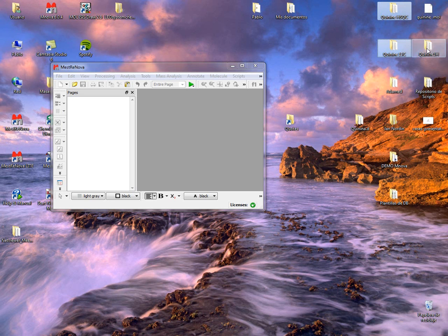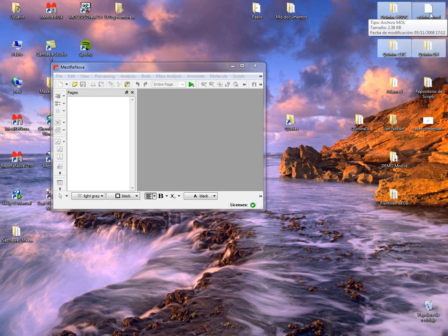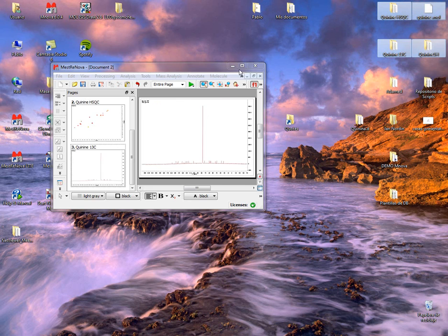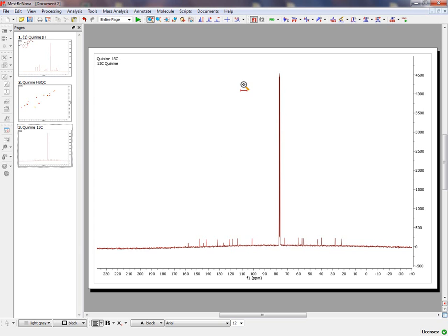Let's see how we can import a Proton, a Carbon, a HSQC, and a MOL file into MNOVA. Just select the folders and drag and drop into MNOVA.